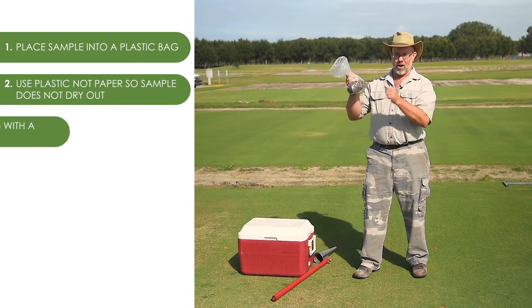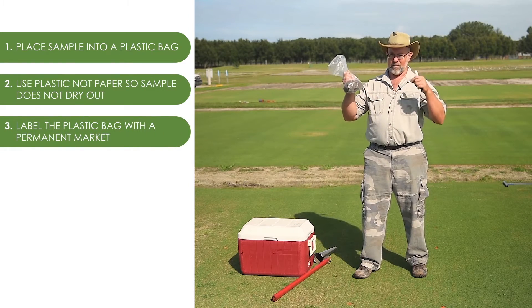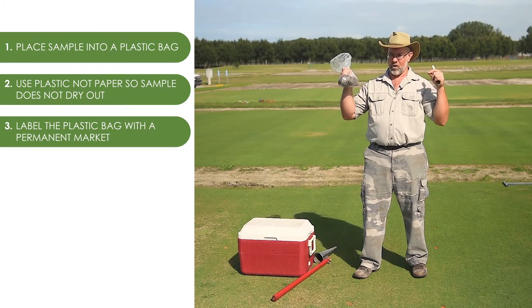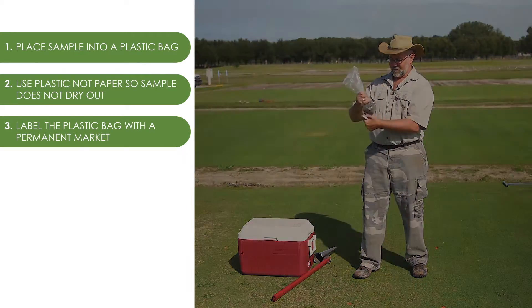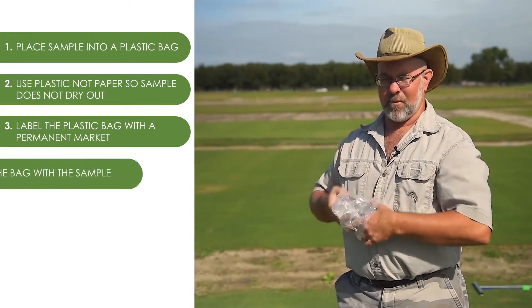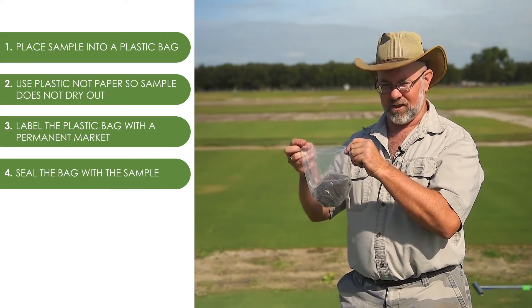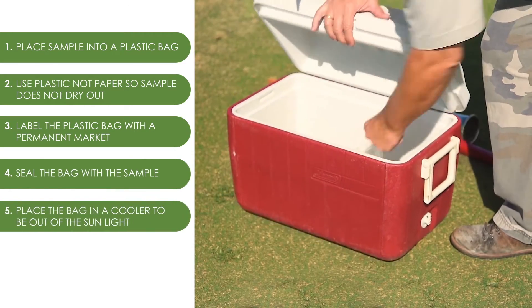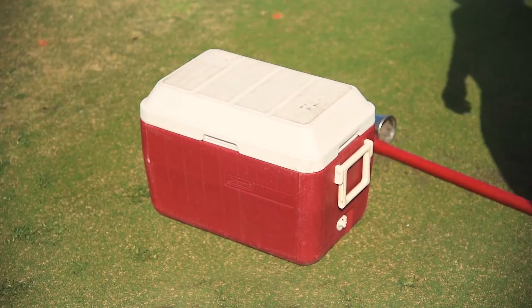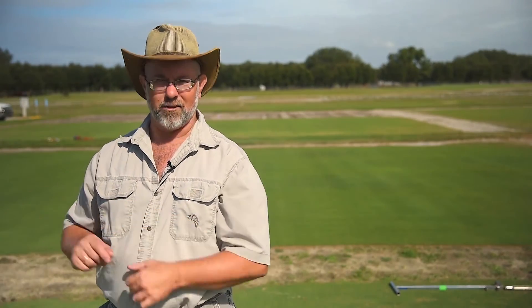We label our bag with a permanent marker that doesn't rub off, and if we're sampling multiple greens, it's important to know which sample goes to which green because we can have very different nematode populations between them. Now I'm going to seal this up, and because we don't want to overheat the nematodes, we don't want to leave this out in the sun. So I am going to put the sample in this cooler to get it out of the sunlight and then keep it in a cool air-conditioned room until I get a chance to send it off to the lab.